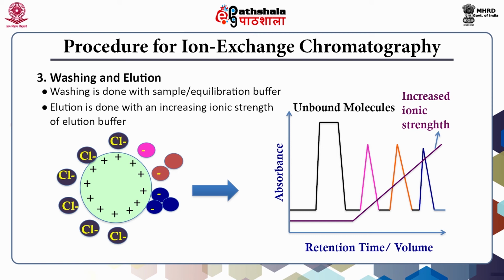Overall, the right side picture represents the chromatogram of one ion exchange chromatography experiment showing 3 different kinds of pure molecules that are eluted out of the ion exchange chromatography column.